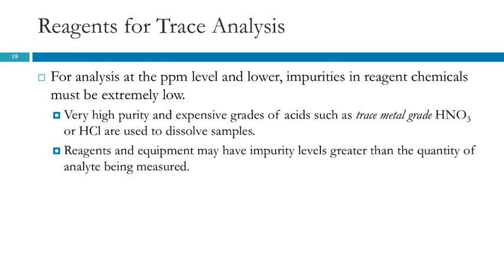There are trace metal grade acids like nitric acid and hydrochloric acid that can be used to dissolve samples. You don't want to dissolve your sample and be introducing your analyte in the acid you use to dissolve the sample, right?